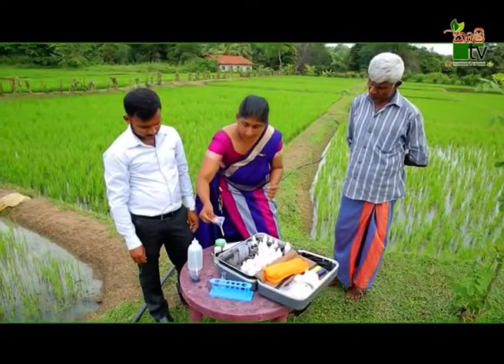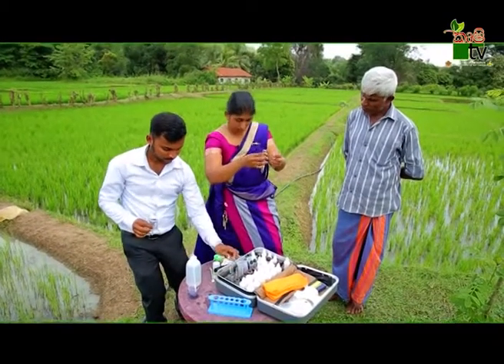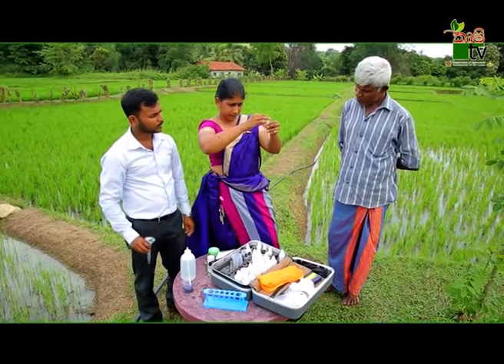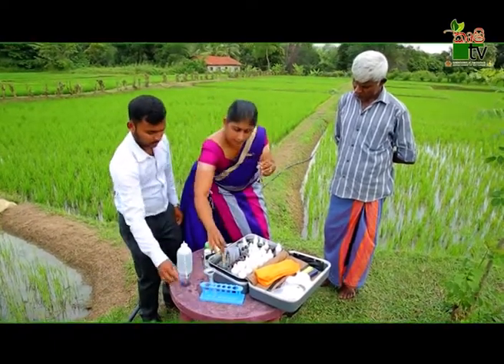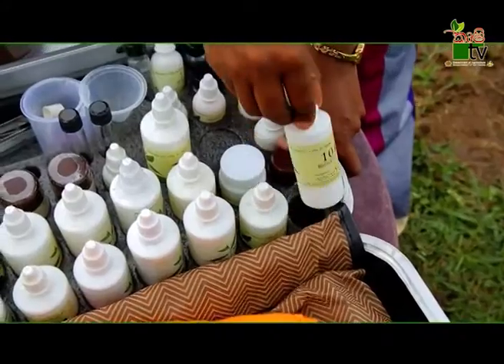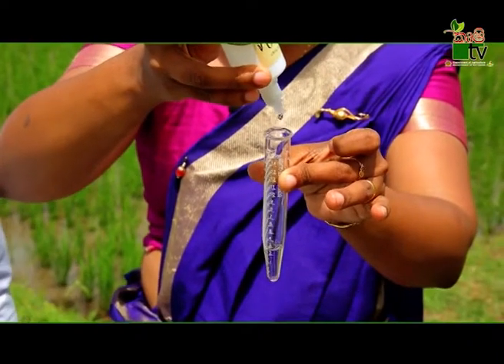Now, we put a sample of 1 ml of this. Then, we put a sample of 1 ml of this.